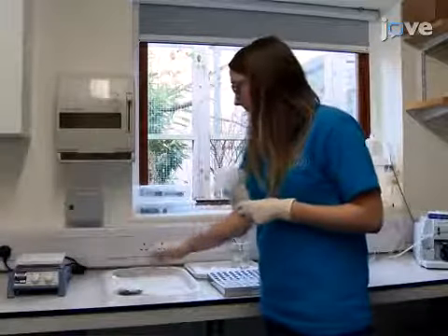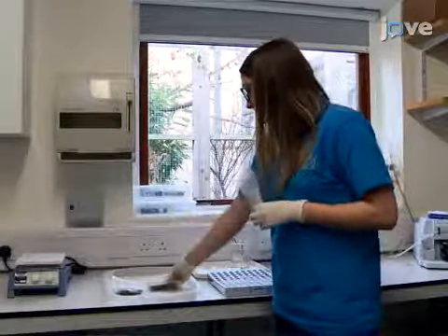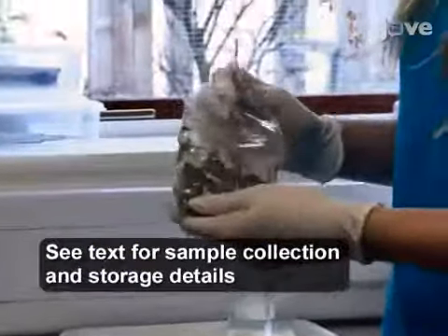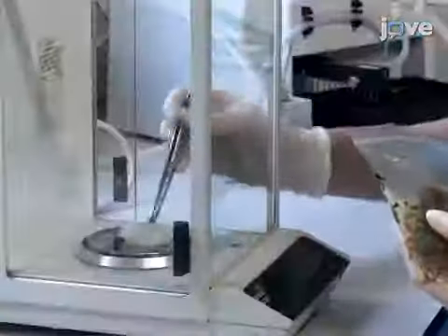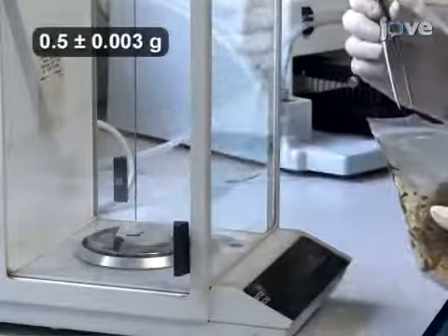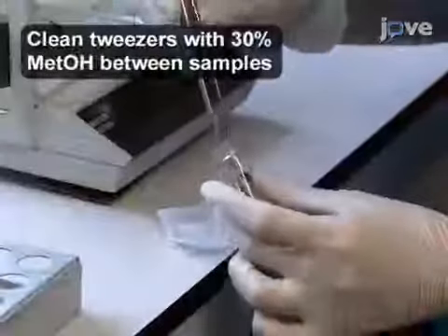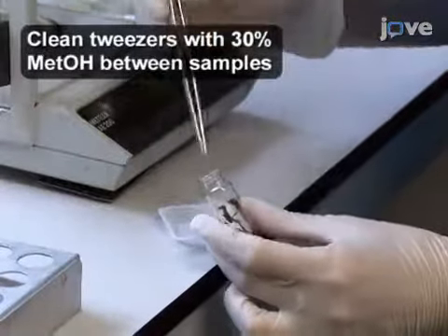On the day of the experiment, after thawing at room temperature, manually homogenize the fecal samples by mixing within each individual sample bag. Then, for each sample, measure out the appropriate amount of feces on a microbalance in a clean weigh boat and transfer the samples into individual 8 ml glass vials.